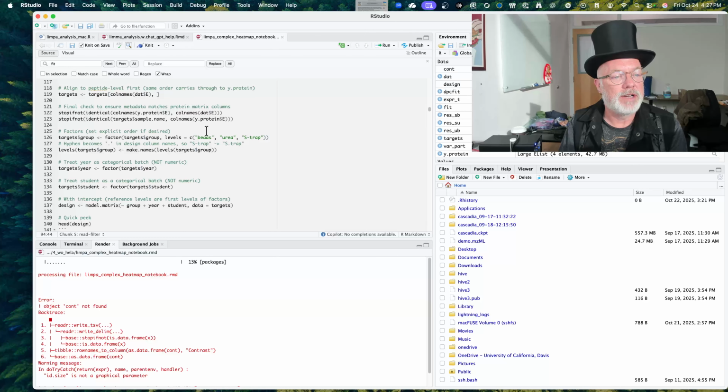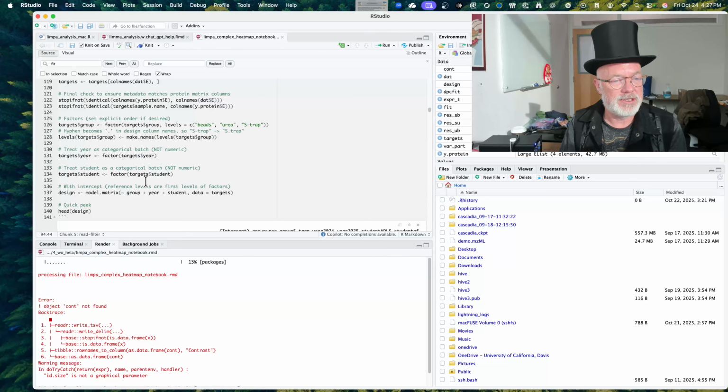All right. So we have three variables. Some of this may not be important, but some of the variables is I have a group, and that's whether I did a magnetic bead digest, or urea digest, or an S-trap digest. And then I have the year. So the year the course was done, 2023, 24, 25. So I have 3 years worth of data. And I also have the students' initials.